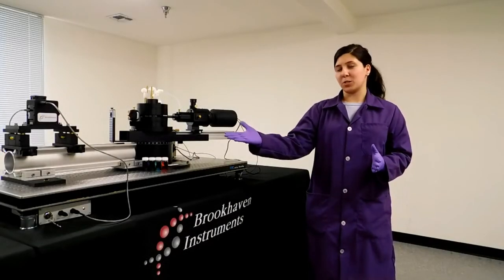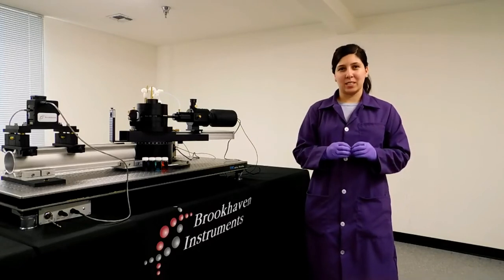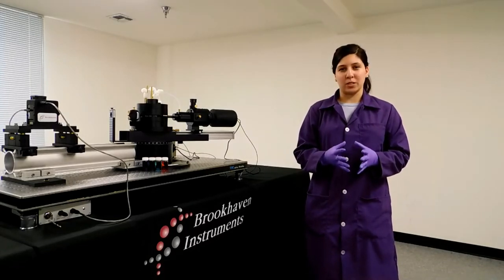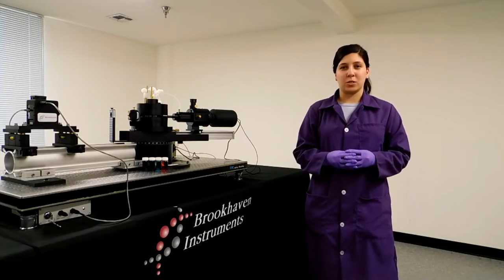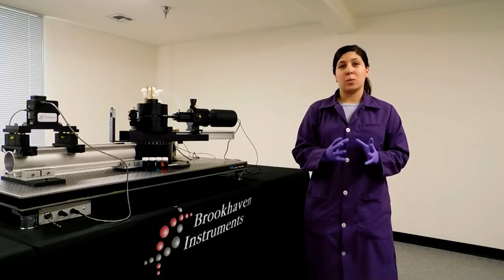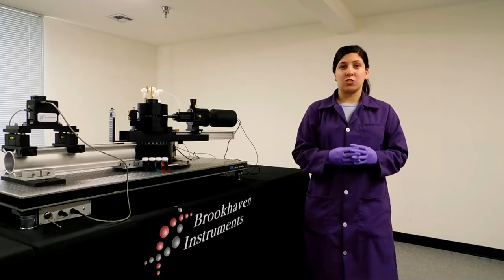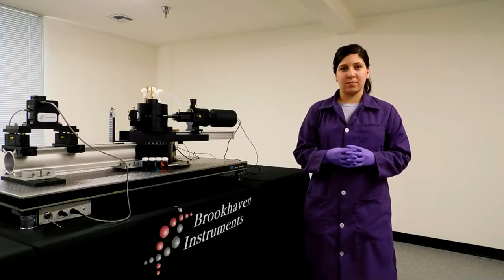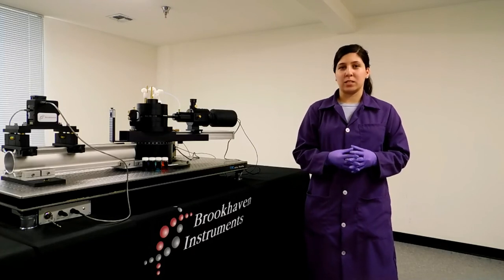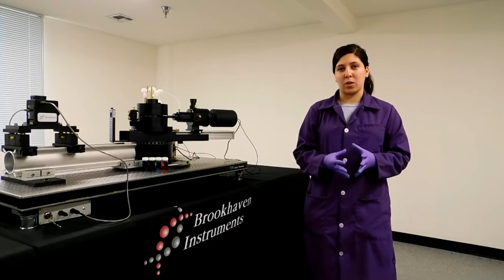Now your goniometer is fully assembled. Check that the system is in good alignment by using the goniometer alignment software. You can find a step-by-step guide on how to do this at the end of your alignment manual. Once it is in perfect working condition, it should remain that way as long as no knobs are adjusted unintentionally. You can periodically check that the system is still in good alignment by running the alignment software on a routine schedule.